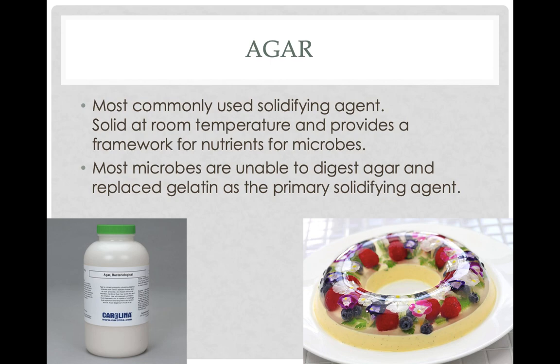Agar is a derivative from seaweed. The red algae, Rhodophyta, is the phylum of seaweed that produces that. It's also the same thing that they use to wrap sushi, nori. It's actually red when they harvest it. It dries out and turns green. So if you guys see down here, this is used a lot in cooking. It's called agar. They use it a lot to make clear gelatins and things like that. It has no taste. It's also vegan friendly. So it's kind of the vegan gelatin, but they use it in microbiology.